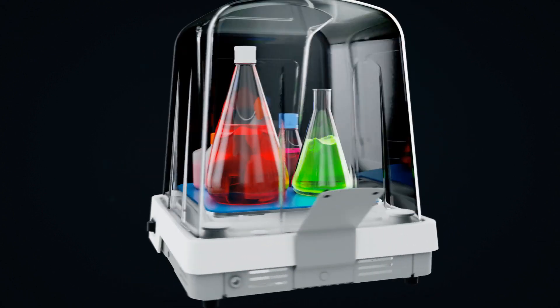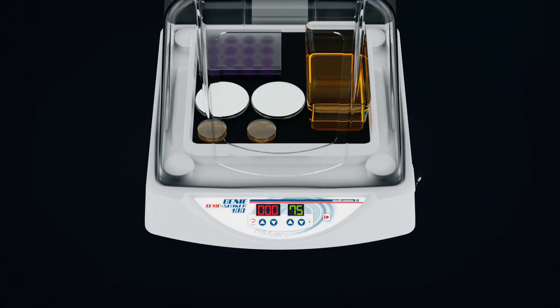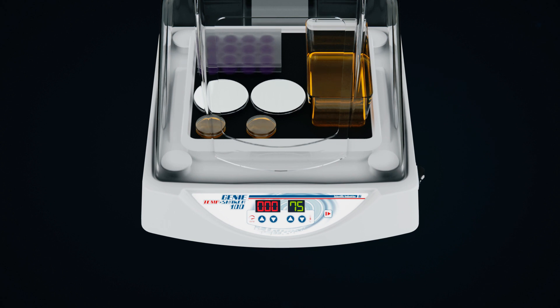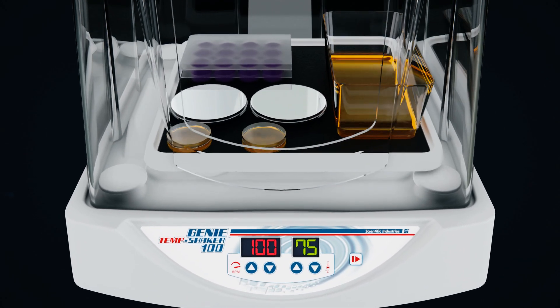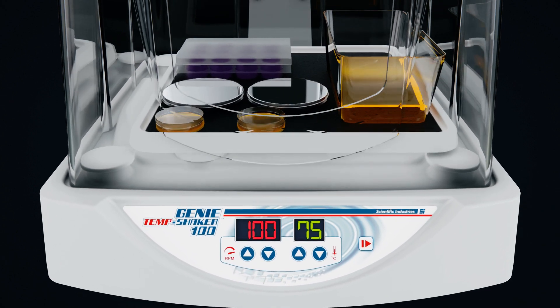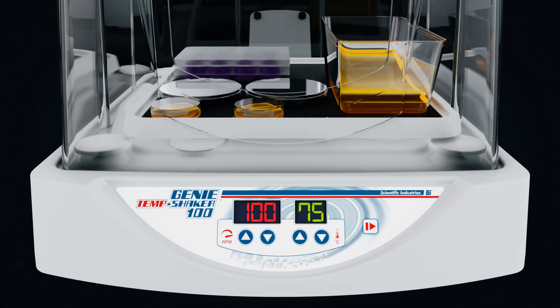Always effortlessly, without the need for tools. A non-slip and non-spill platform combined with an advanced 100 RPM motor makes the GTS 100 ideal for precise and gentle shaking applications.